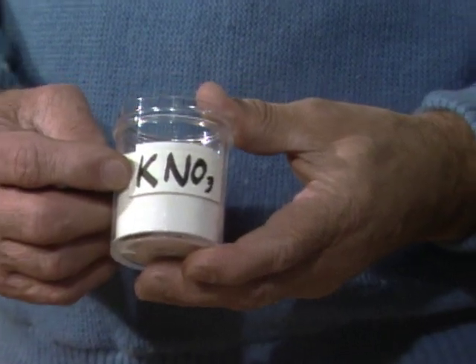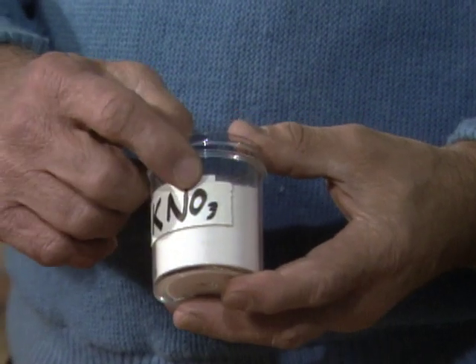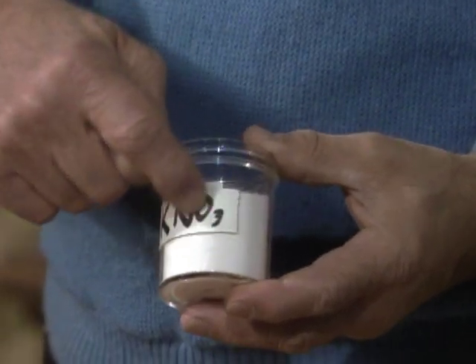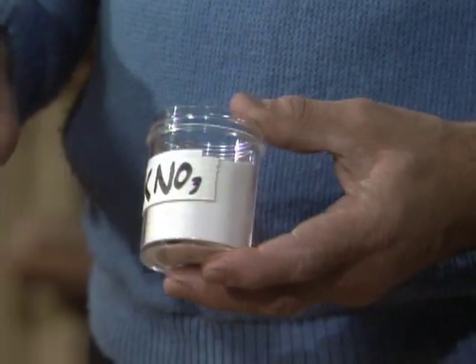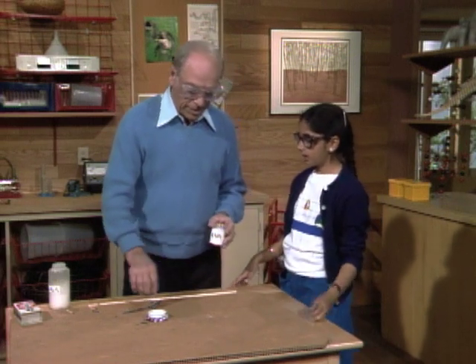Do you know what the K stands for? No. Potassium. The N? Nitrogen. And O? Oxygen. Yes. And it's that bunch of oxygen right there that we're going to release and combine with the carbon in the sugar. So then it'll catch on fire.